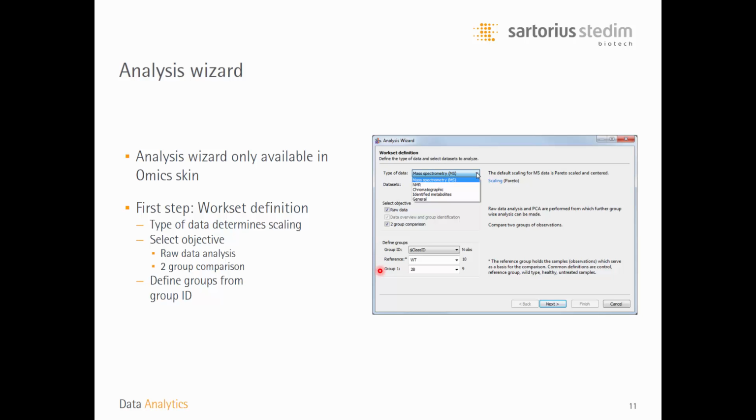And then we have what we call group 1. Group 1 is the group of samples where something has happened. It could be the treatment group, it can be a genetically modified group, it can be a group of individuals undergoing some sort of exposure to a treatment with a chemical or a drug, or it can be a group of samples representing some sort of disease state or some sort of syndrome.